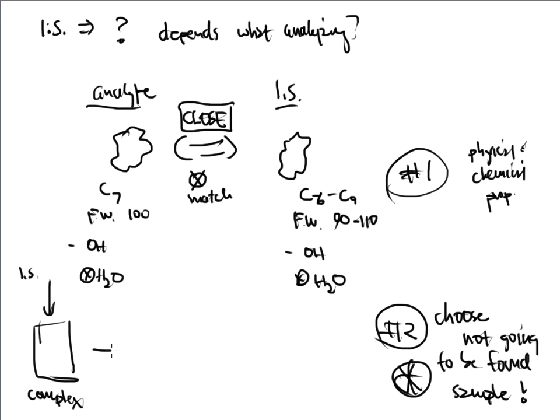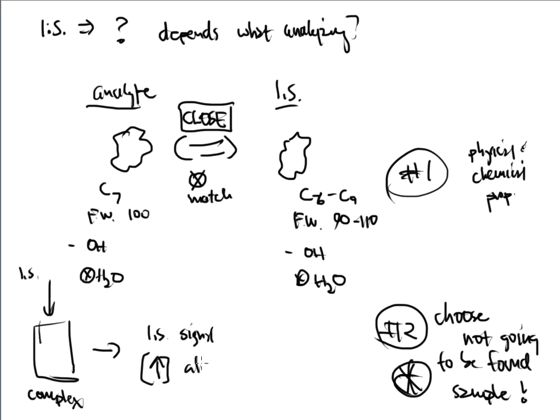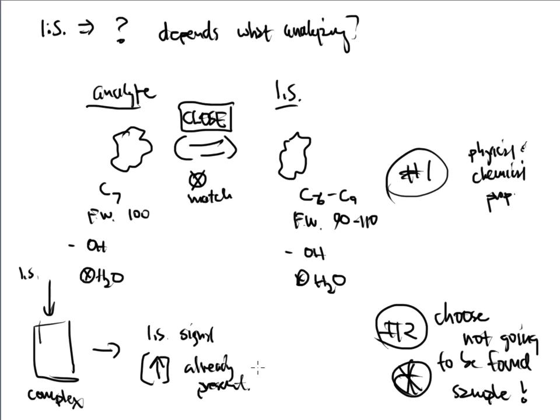Because when I go and analyze this, my internal standard signal is going to be much higher. And the reason is because some of it was already present. And that's going to mess up my calculations. It messes up everything that I want to do here. If it's already there, if it's already present, and I add even more to it, then the signal is going to be lying to me in a way.